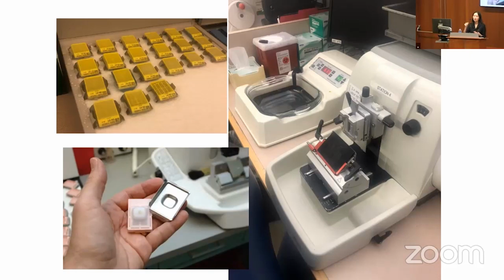And what I want them to do on bone marrows is give me 2 to 3 micron sections. So very, very thin sections, almost like transparent sections of wax with a slice of tissue that then they float onto this warm water bath, take a charged slide, scoop it up, and that's where you get 1 slide. Every single tissue has their own protocol.